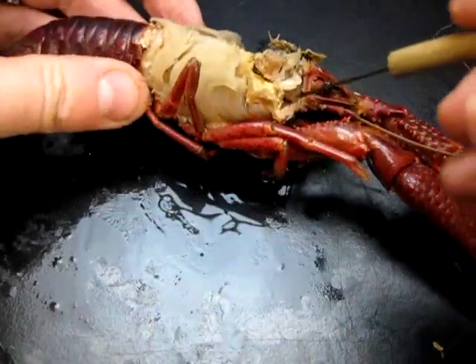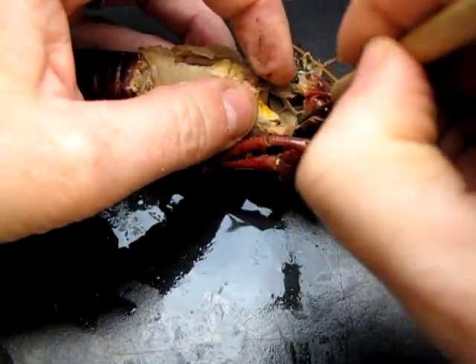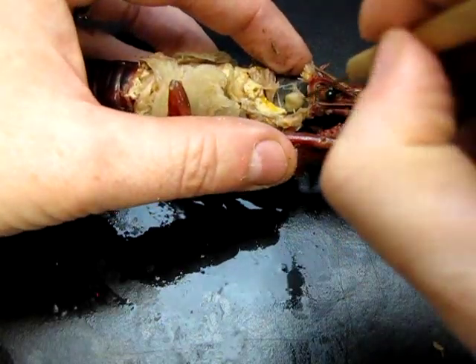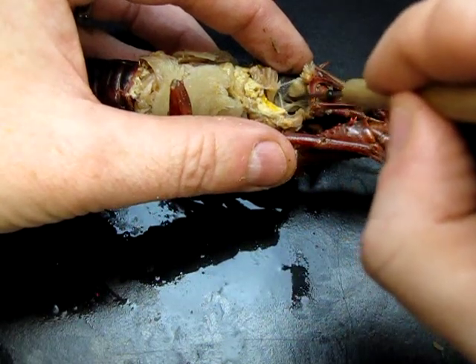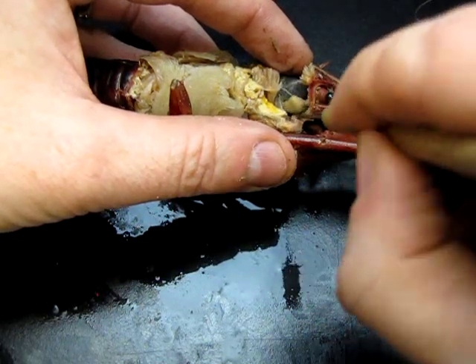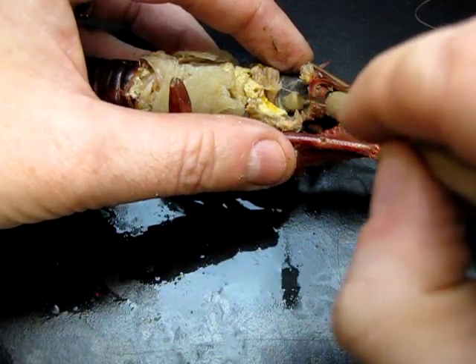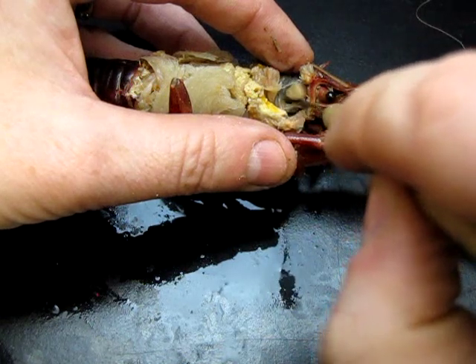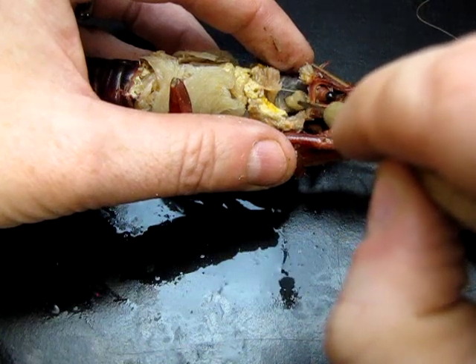The other thing to point out is the excretory system. If you poke around in the cavity by the head, you can find another glandular-looking structure right here — that's called the antennal gland, and it acts like a kidney. It's responsible for excretion of waste products.